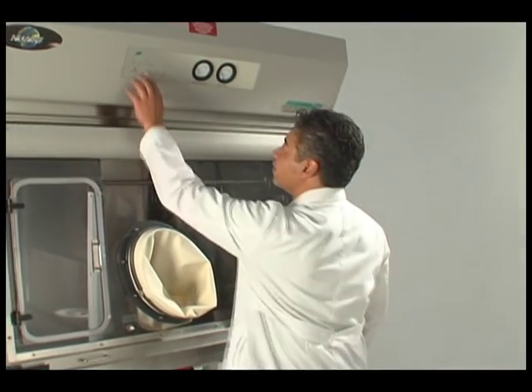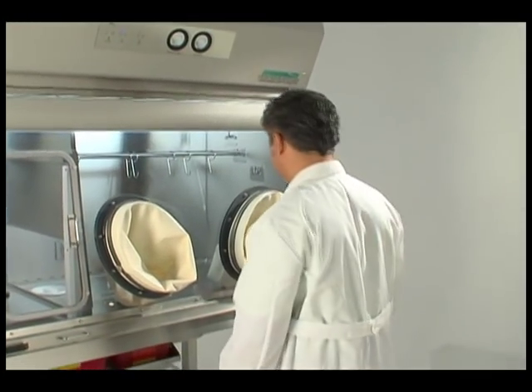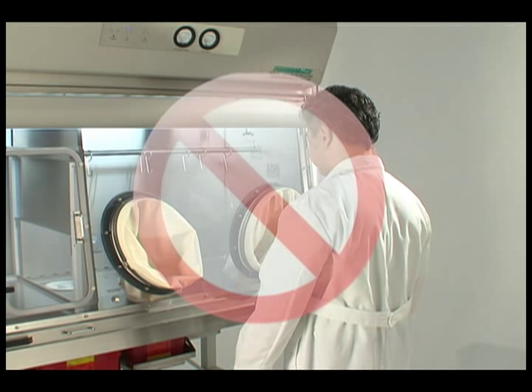Before attempting to replace gloves or sleeves, it is recommended the isolator be running to flush the work area with clean air. Do not attempt to replace gloves or sleeves on a negative pressure isolator if the work zone is not known to be contaminant-free.